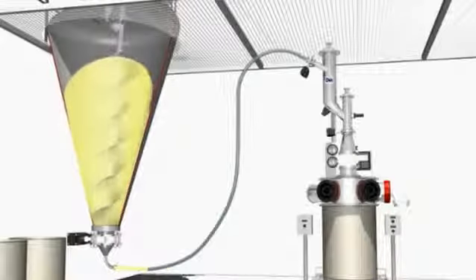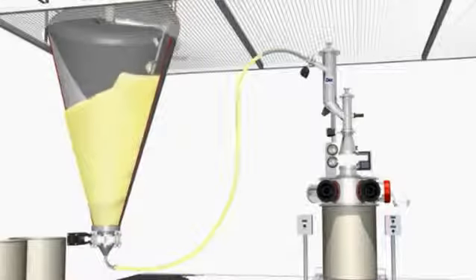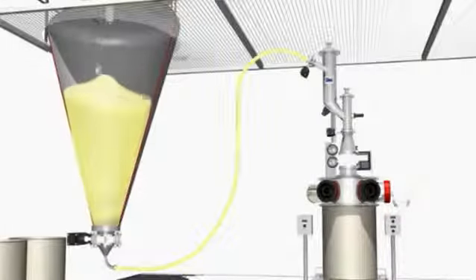The DCS is a major system application for the handling of powder in drums, both into a system and out from a system. It benefits from being simple to operate, flexible as it can handle a variety of drum sizes, and is operator friendly.